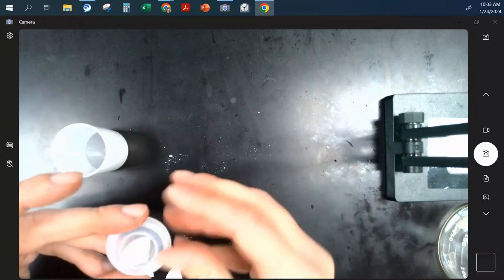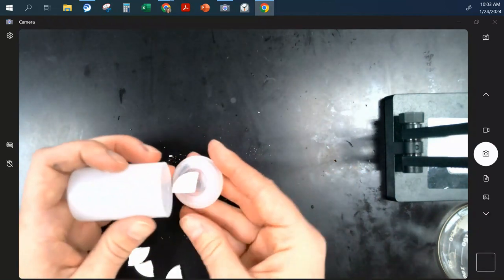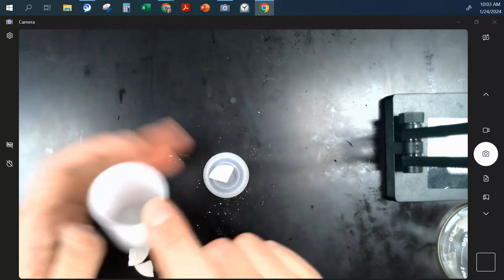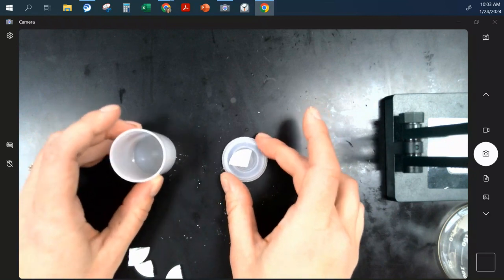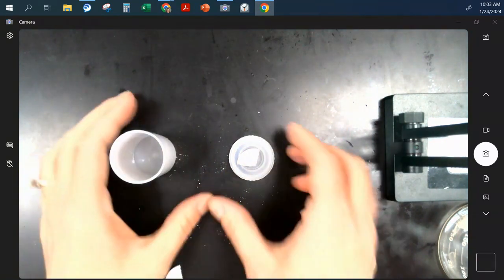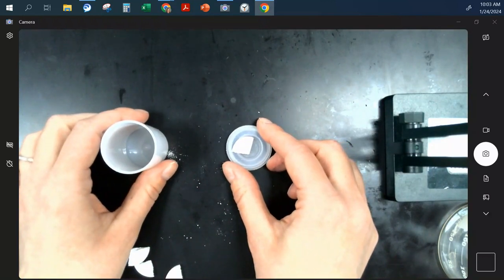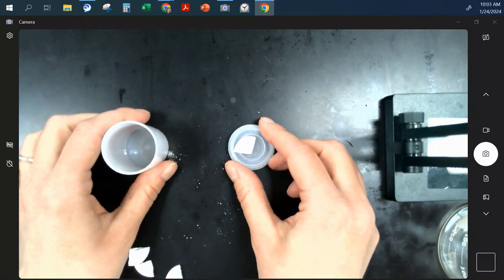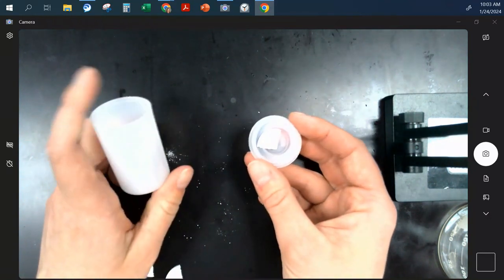And then if I wanted to measure the temperature dependence, I'm going to add water to this. What could I do to change the temperature of the water? Put it on ice, or we could heat it up in the tap water. We could use hot water. Okay, so this one would be an easy one to measure the temperature dependence. This one we could also measure the concentration.